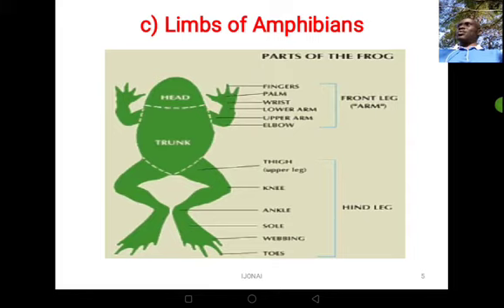You can also proceed to look at more about the skin and appreciate more. You can catch the organism and observe the skin, look through it and identify many things from the skin, comment about them, so that you can be a very good student.